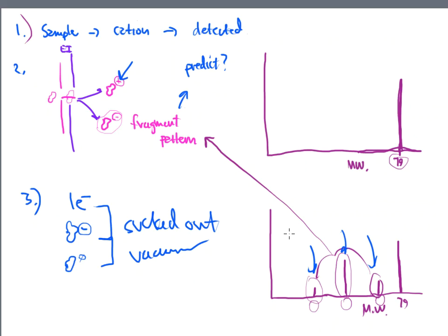Not only that, but with these fragmentation patterns, keep in mind we keep talking about isotopes, right? And you're probably wondering, well, why did I even go into this discussion? Well, I told you there was a carbon-12 and there was a carbon-13, right? So let's say that we've got a methyl group, a CH4 group that we have inserted into the MS.